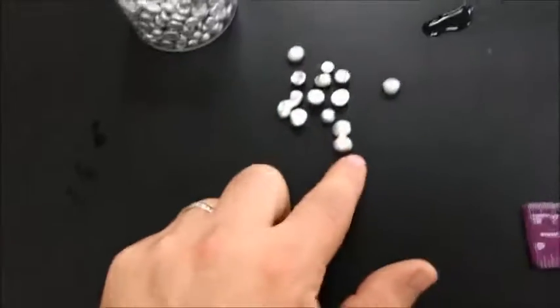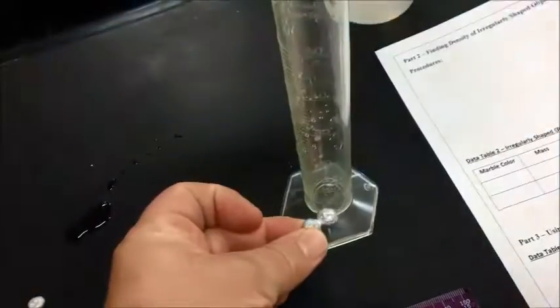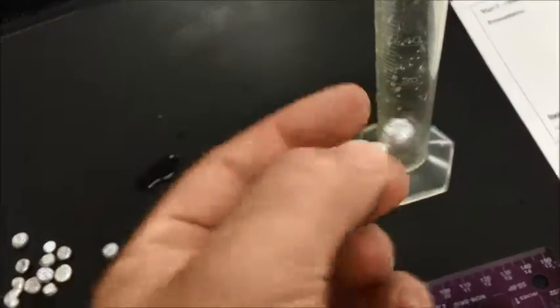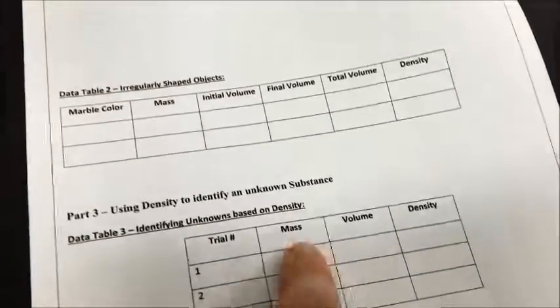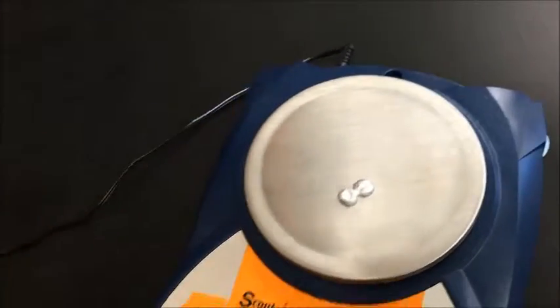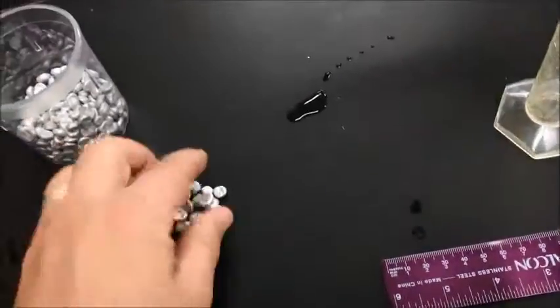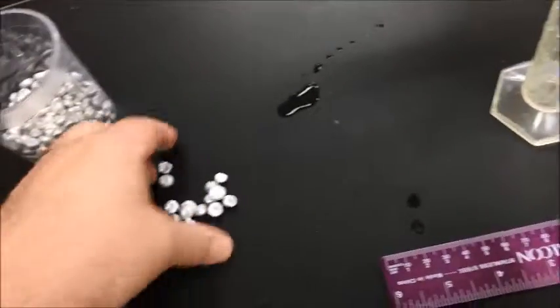So notice you'll probably have to find the volume of these things using displacement. Okay, they're not regularly shaped. So you'll have to find the volume through displacement. The mass, make sure you mass them before you find their volume. You don't want to be massing the water. And I suggest when you do your unknown to get a few pellets, not just 1 or 2. The volume might be too small to measure. So get a few pellets, a small pinch, let's say, to do the mass and volume on.